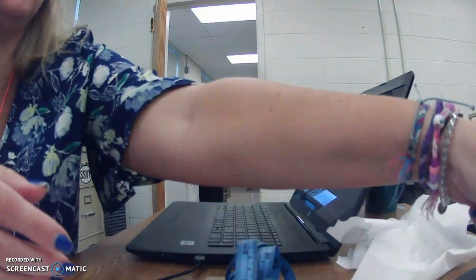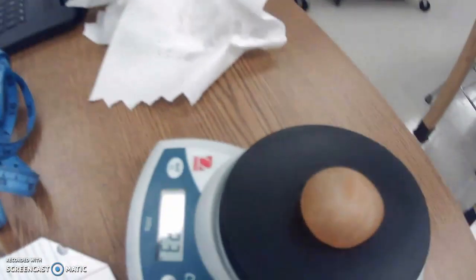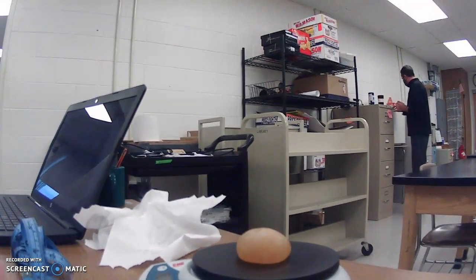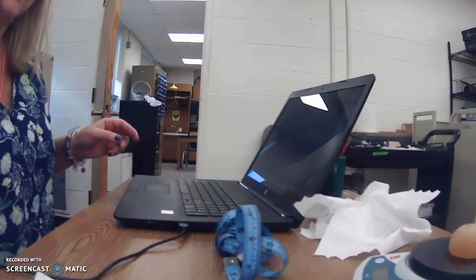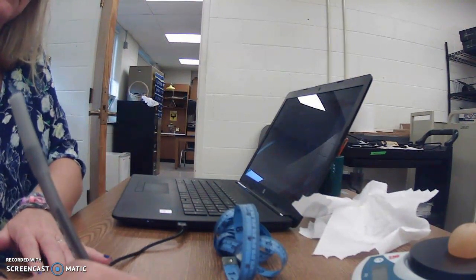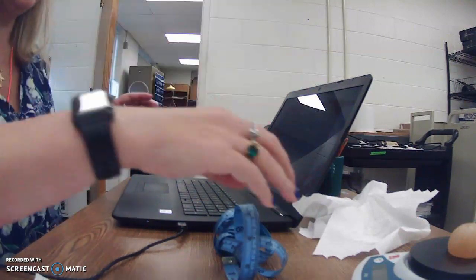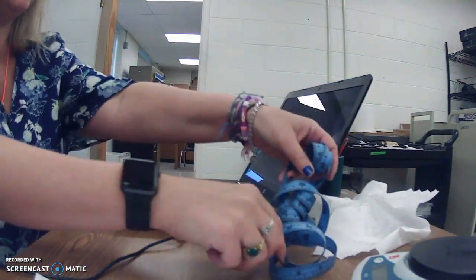Now I will weigh it. So it is down to 42.3 grams. And I'll take a measurement of the circumference.